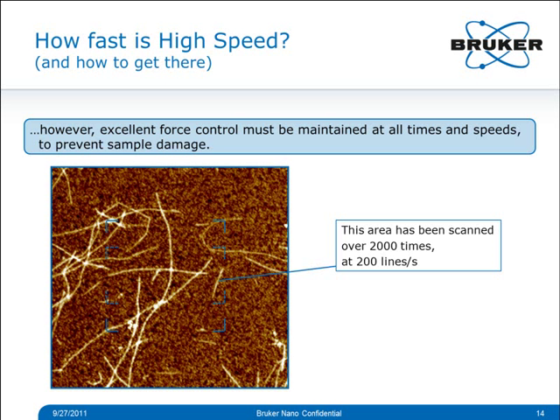Here we see a zoom-out of the area where all the previous movies were taken. The central area was imaged over 2000 times at 200 lines per second. No imaging window was created by the repeated interactions. Of course, this sample — while being a biosample — is also a static sample in air. So let's move on to some real examples of dynamic AFM applications.